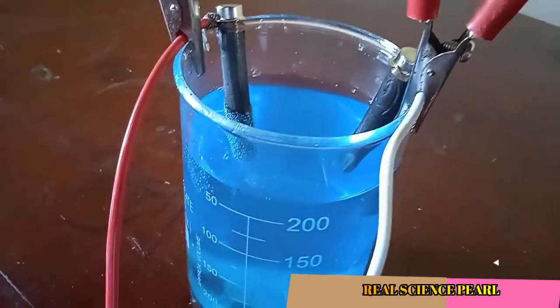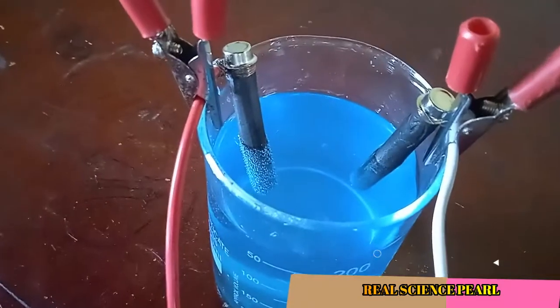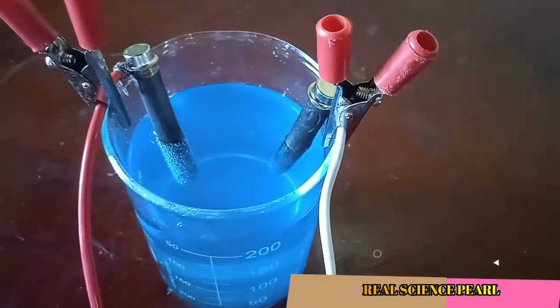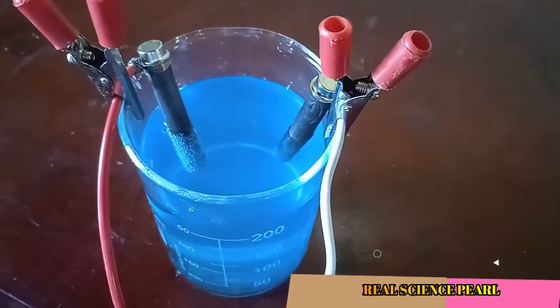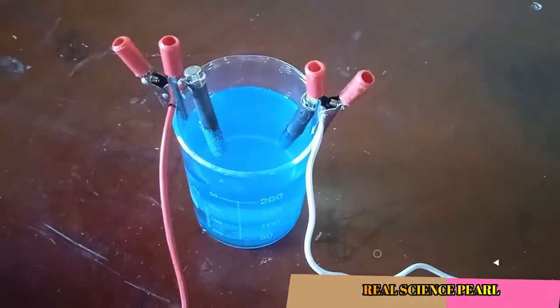So how are we going to do this? We are going to observe up to the end so that we see what we are going to form there at the cathode, and we are already seeing the product at the anode. So it requires some bit of patience, and sometimes you have to increase the power.